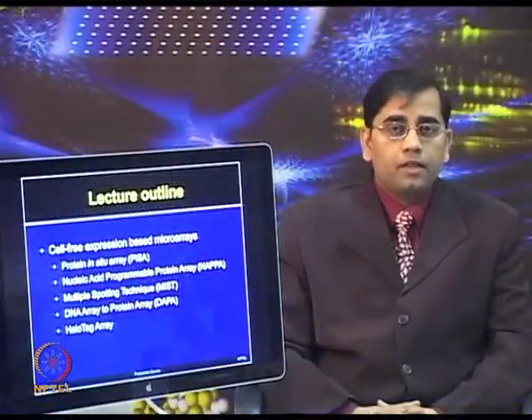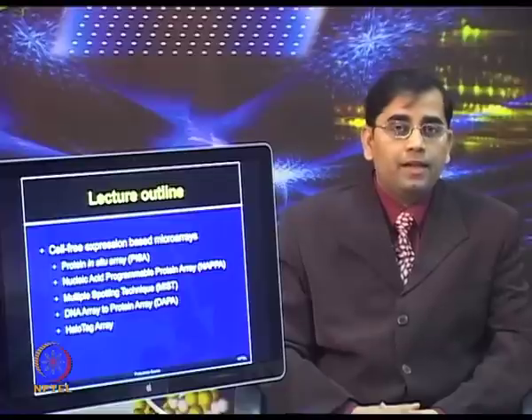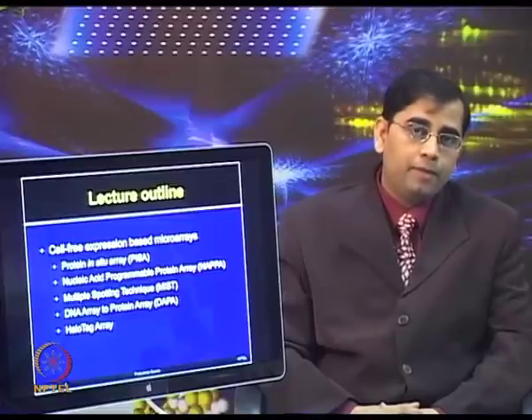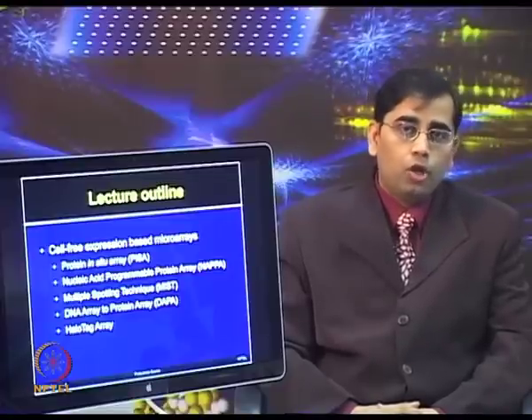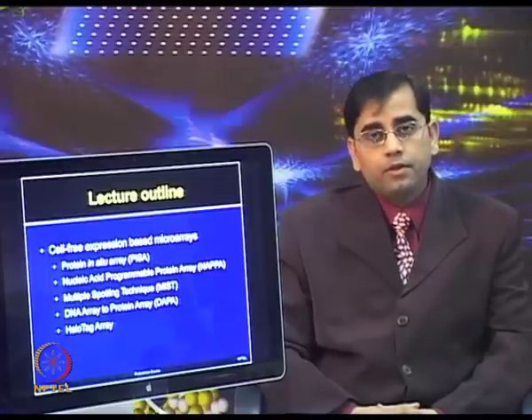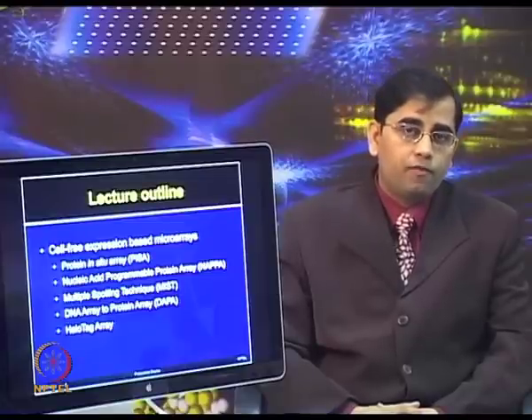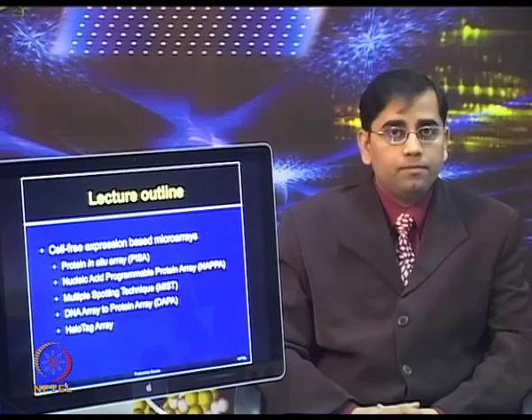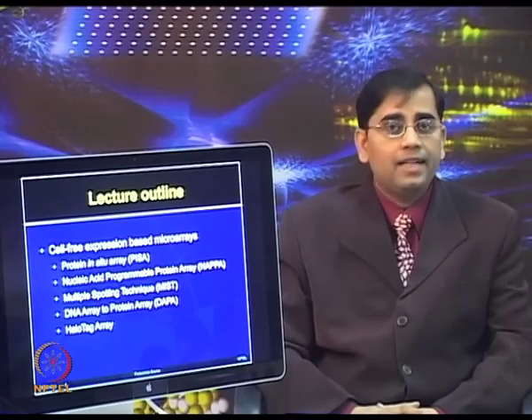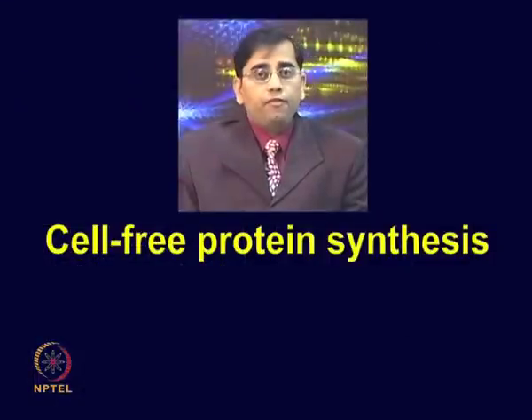These are some of the major cell-free expression based platforms, but other cell-free synthesis based microarray systems also exist. So, we will discuss the principle of each one of these protein microarray platforms as well as their advantages and disadvantages. So, first let us review cell-free protein synthesis.